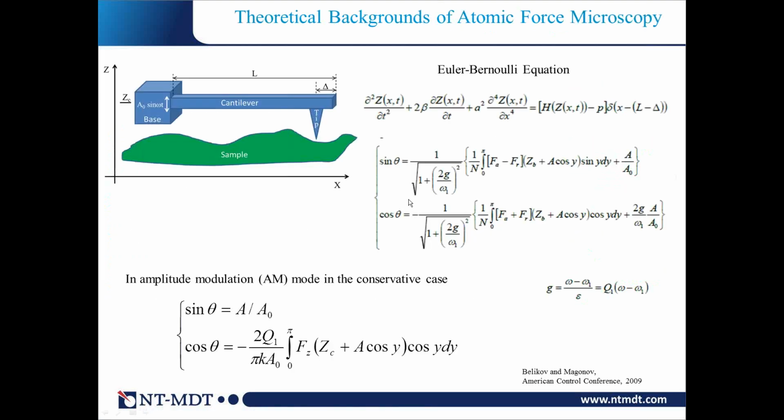I start with the theoretical background of atomic force microscopy because we found this very useful in understanding the different issues of atomic force microscopy application. This work is based on our cooperation with another Sergei, Sergei Belikov, who was my colleague when I worked at Veeco in the 2000s, and now I'm pleased that he has joined us at NT-MDT Development, and we now continue working together in this field.